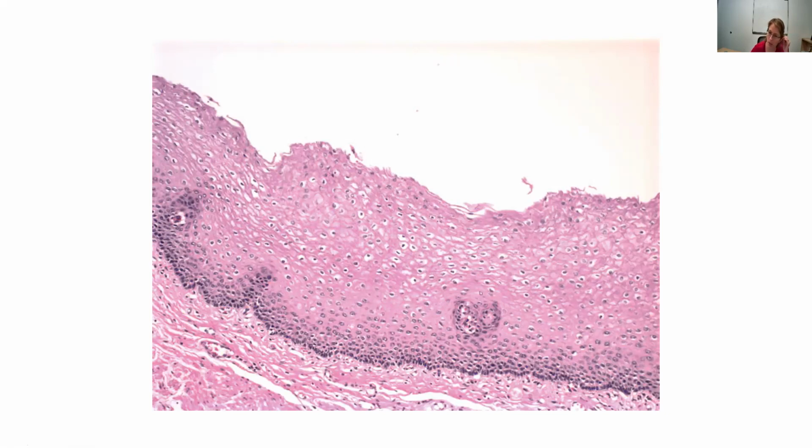None of those are possibilities. So for epithelial tissue, what kind of cell types are there? There's cuboidal, there's squamous, and there's columnar. What am I looking at here? I don't think I see anything that looks like a column. So I'm going to just toss out columnar. All the varieties of columnar tissue, gone.